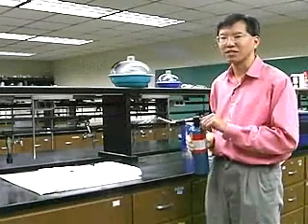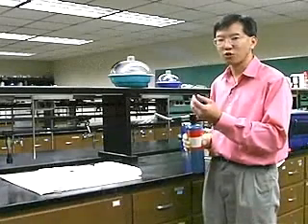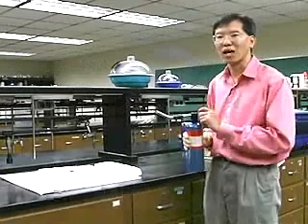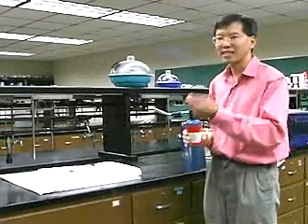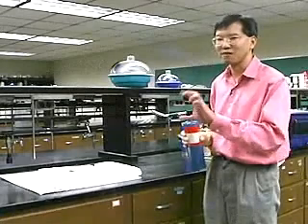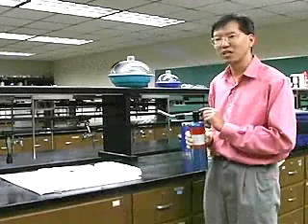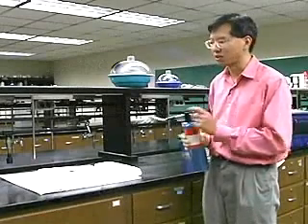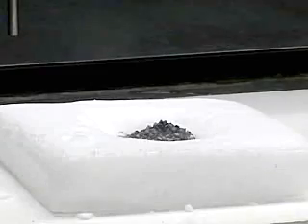Lots of special effects use this. For instance, oftentimes when somebody's trying to pretend that they're going to blow the lock on the old Wild Wild West, Jim West would always take something out of his pocket and stick it in the lock of the jail and light it, and it would burn white hot, and then suddenly the jail door would pop open. That was very often a piece of magnesium ribbon. Well, this is magnesium shavings, but the effect will be the same. You'll see a white hot light.